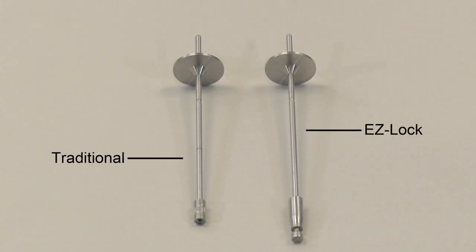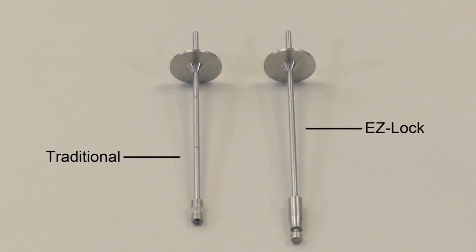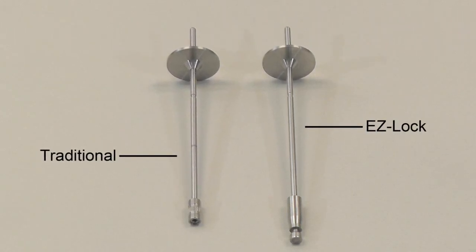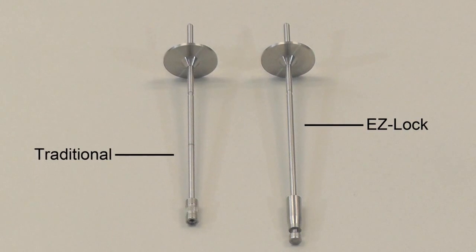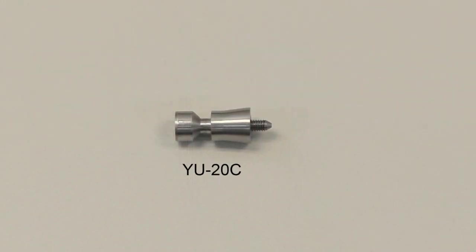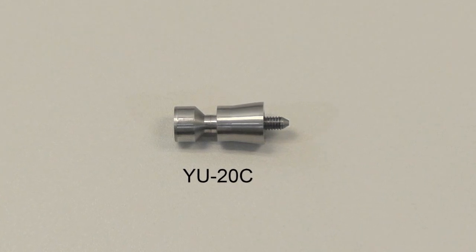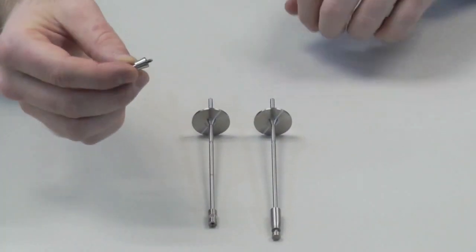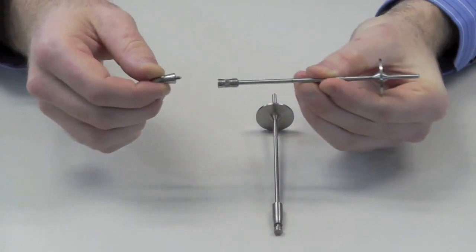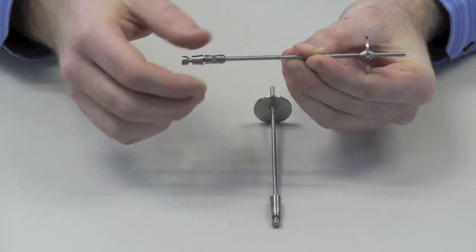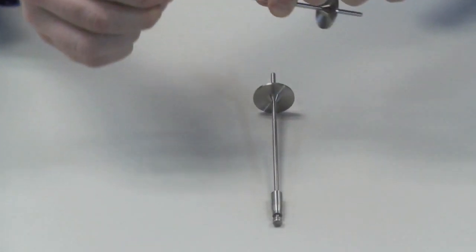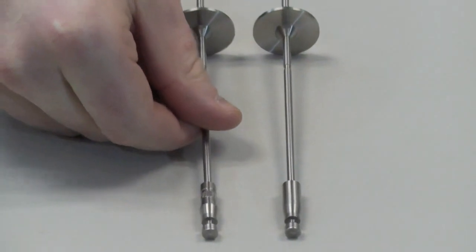Here we have a traditional disk spindle next to an EasyLock spindle. If you have your viscometer retrofitted, you can still use your traditional threaded spindles with the help of an EasyLock converter, Brookfield part number YU-20C. When this YU-20C coupling nut is threaded onto a standard spindle, the combined dimensions will mimic that of a native EasyLock spindle.